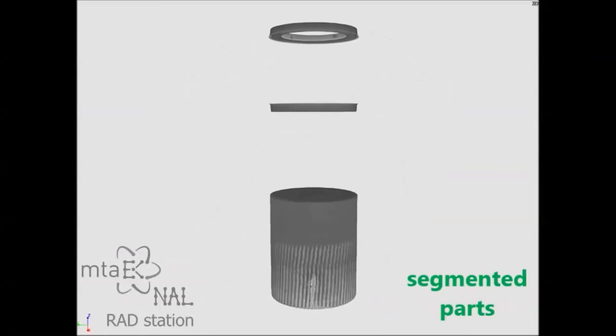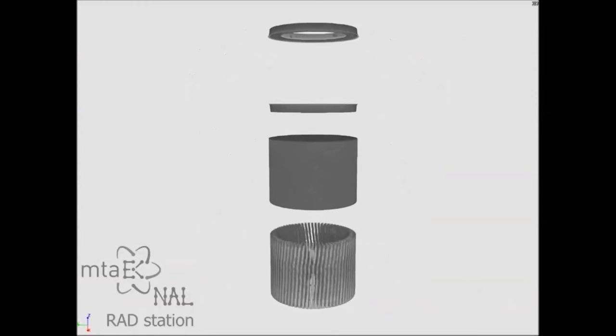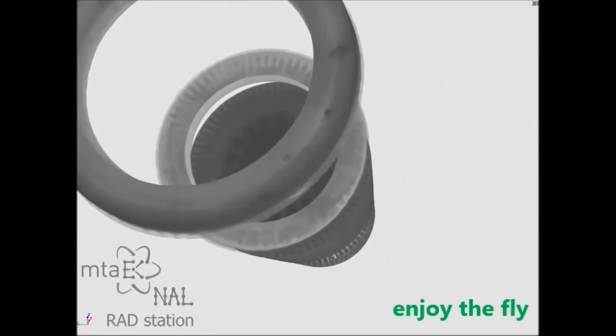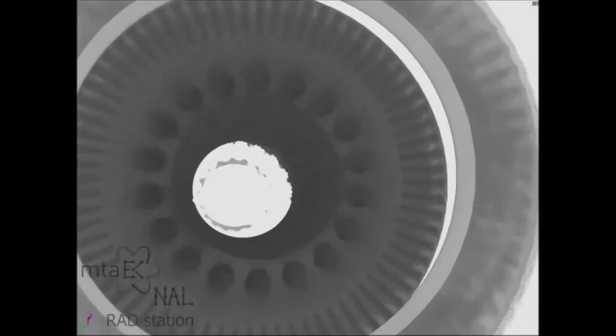Then you can do the segmentation, and afterwards you can make this very nice exploded view where the different parts can be separately shown.